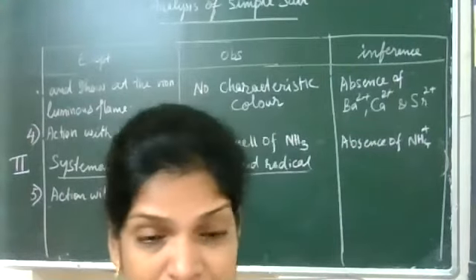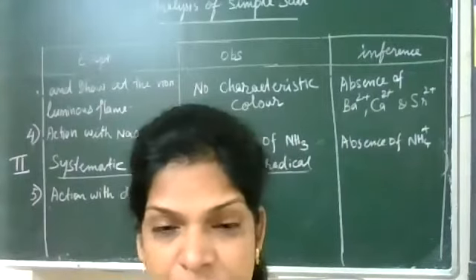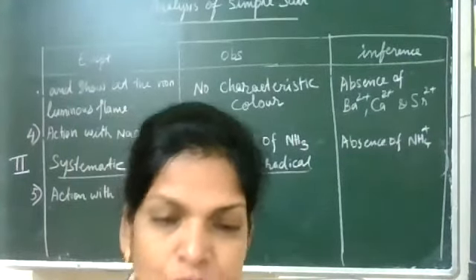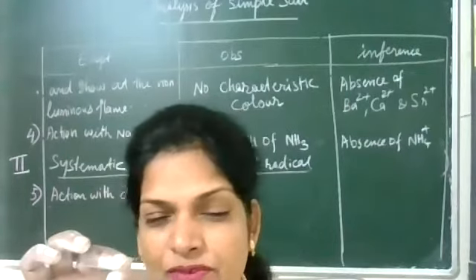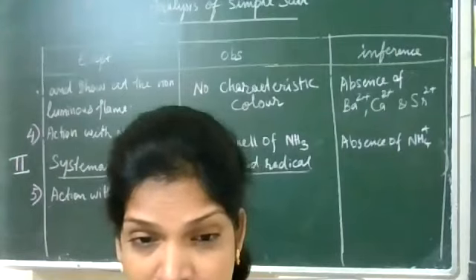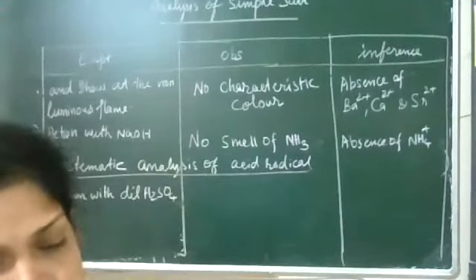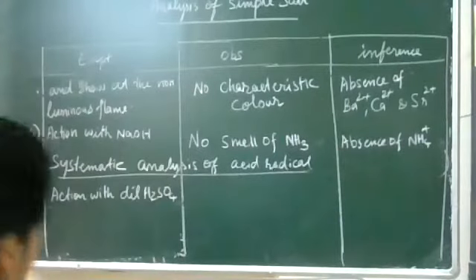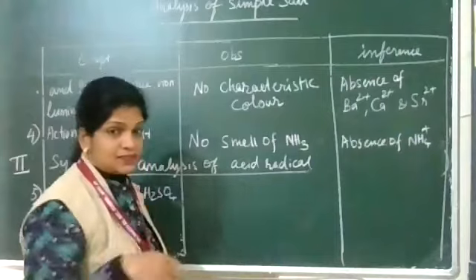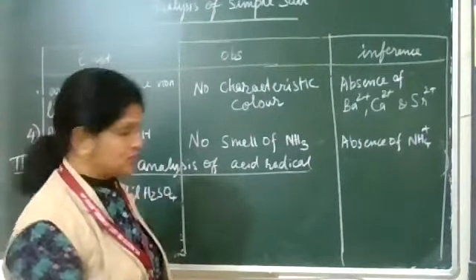So ours is sulfate. Sulfate is not coming in this. By adding dilute H2SO4, these observations you are not going to get. I told you, by rubbing with dilute H2SO4, if you are getting that smell, then you can doubt for acetate, vinegar-like smell. So then we are going to see action with the dilute H2SO4. Here nickel sulfate, emerald green, so you will not get any observation here.